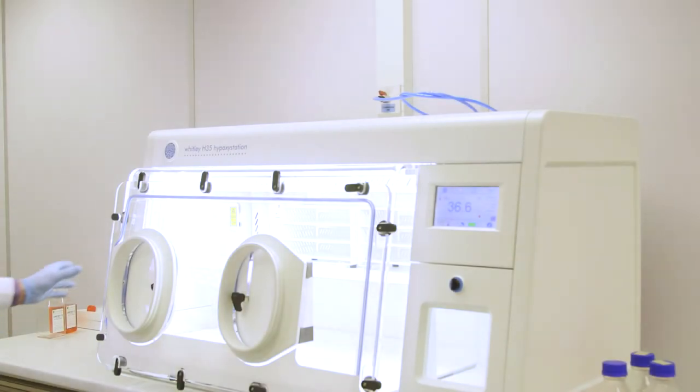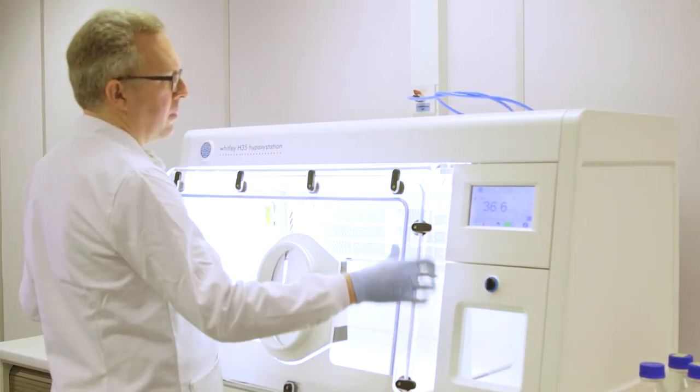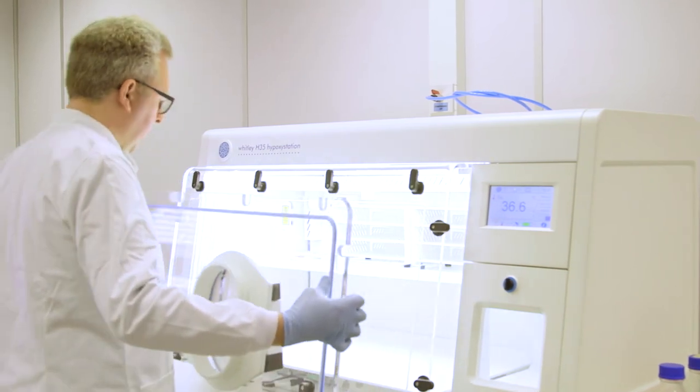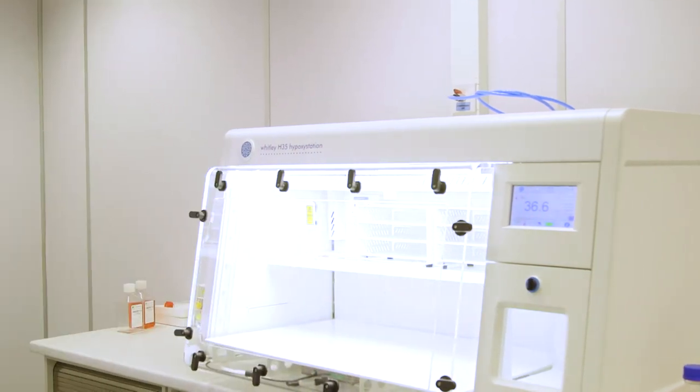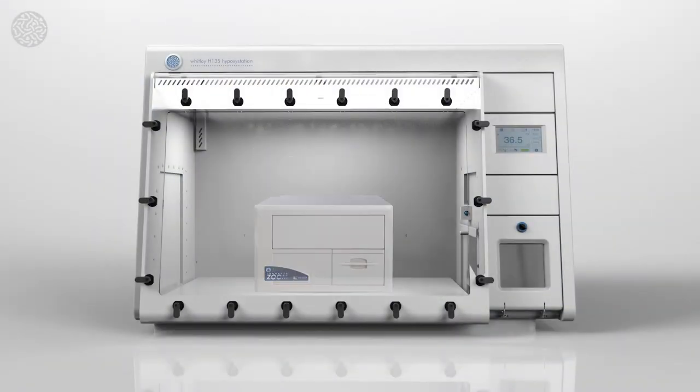The option of a removable front provides the ability to deep clean the interior of the hypoxic station. The front can be easily removed in seconds and provides the capacity to place instruments such as microscopes and plate readers into the chamber.